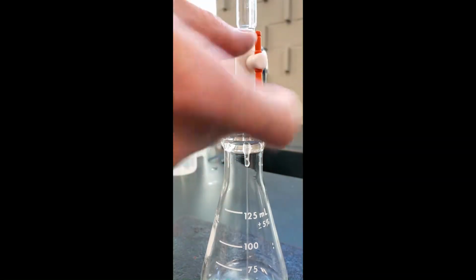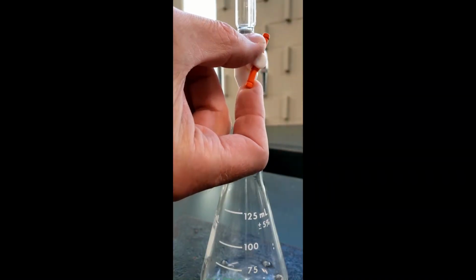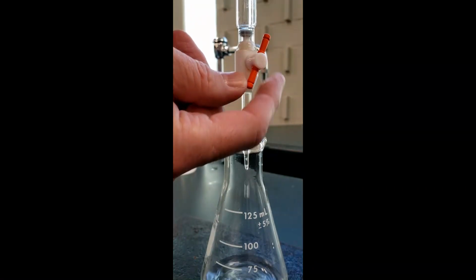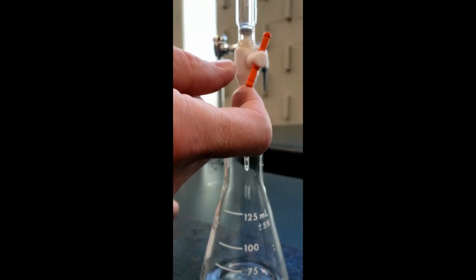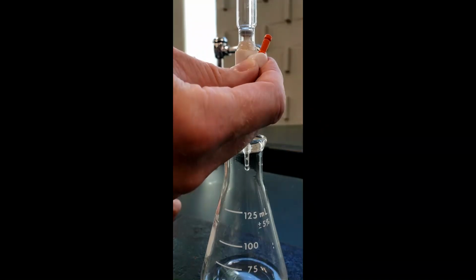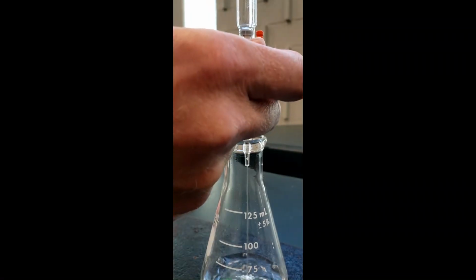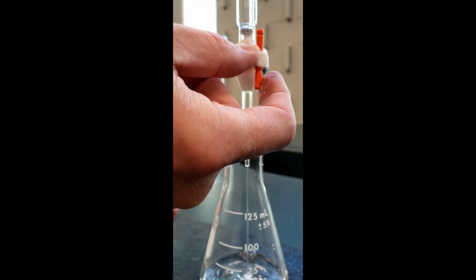And you can control, it's hard. You can control how much water comes through by turning this. And each burette's going to be slightly different, but it doesn't take long for you to get used to how fast the solution is coming in. You can slow it down all you want. Just right. Or you can have it just fly through. So when you do this with each burette, you get the hang of it pretty quickly.